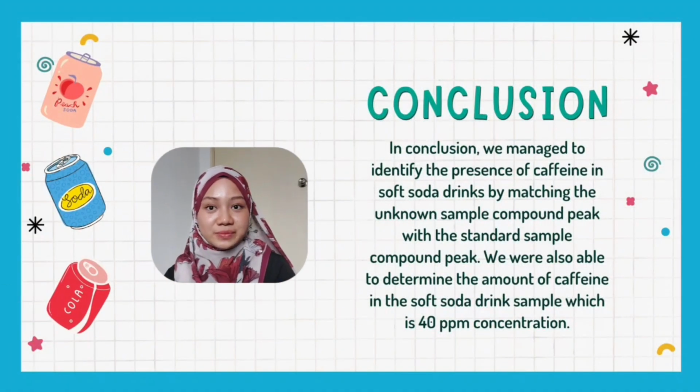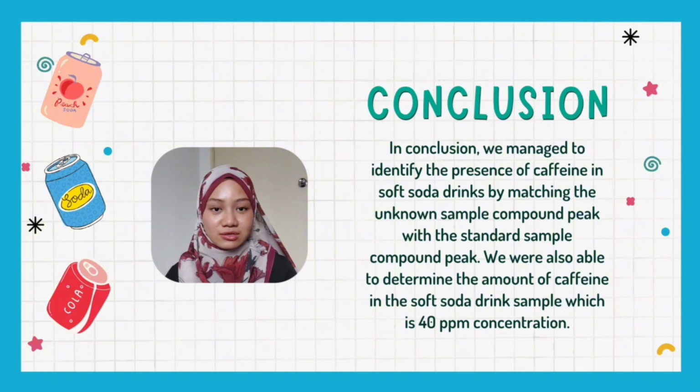In conclusion, we managed to identify the presence of caffeine in soft drinks by matching the unknown sample compound peak with the standard sample compound peak. We are also able to determine the amount of caffeine in the soft drink sample, which is 40 ppm concentration.